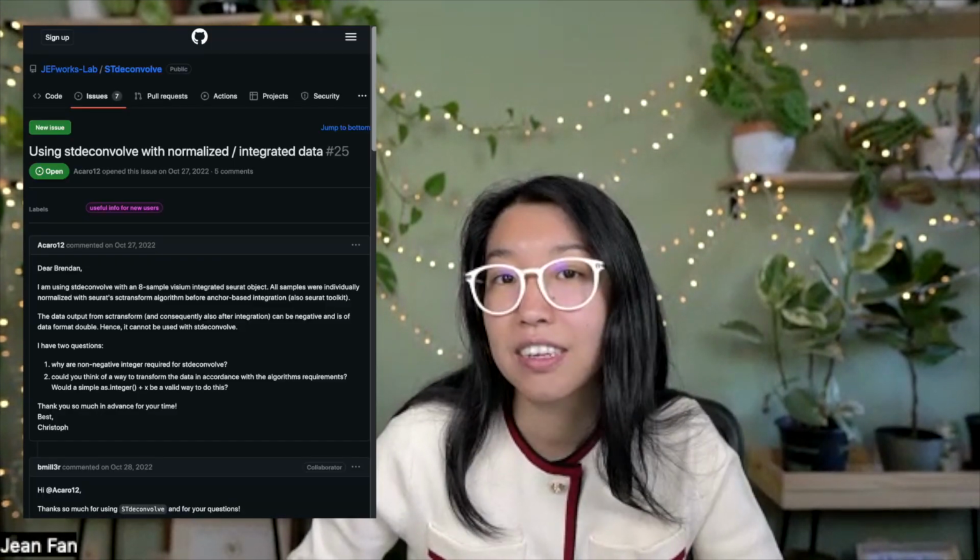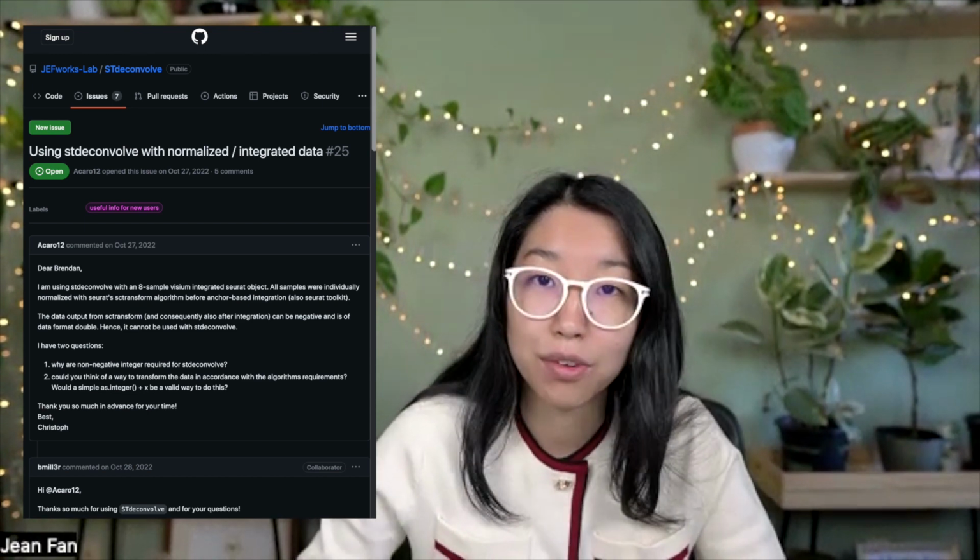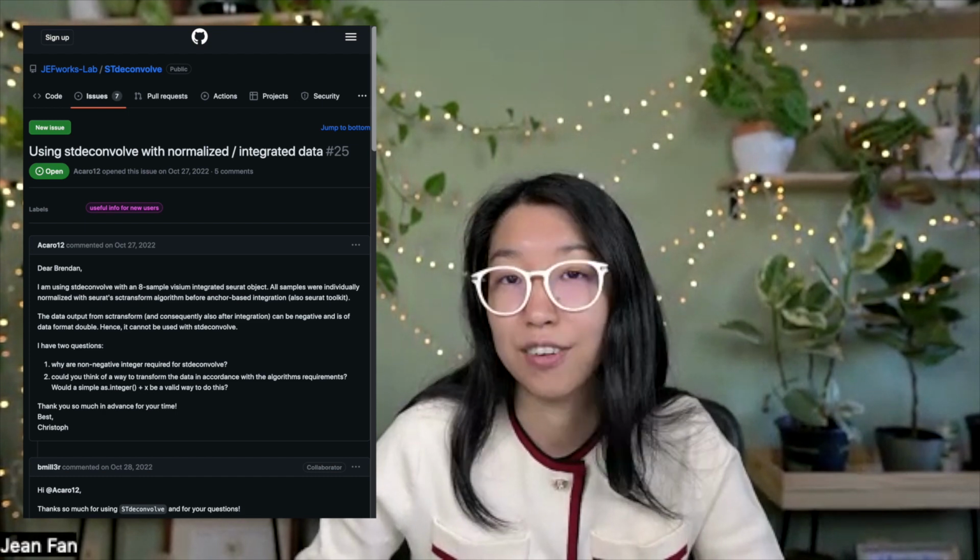And in general, I think it's great to reach out when you have questions, particularly through these public forums where others can see your questions and potentially also see the answers to those questions and even contribute their own answers. So again, this question was about why we perform normalization when doing dimensionality reduction and clustering, but not necessarily when doing deconvolution, at least using our lab's tool STdeconvolve, when it comes to analyzing spatially resolved transcriptomics data.